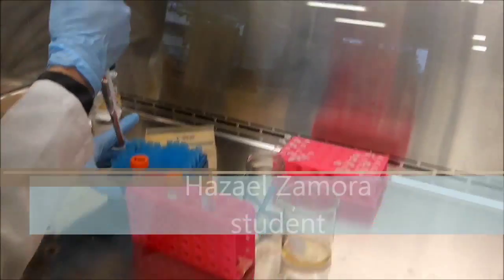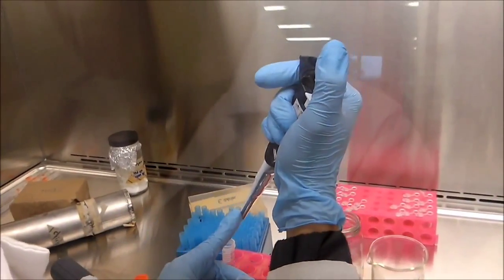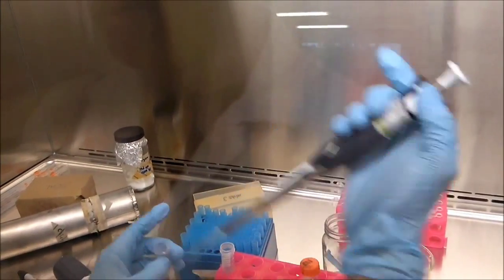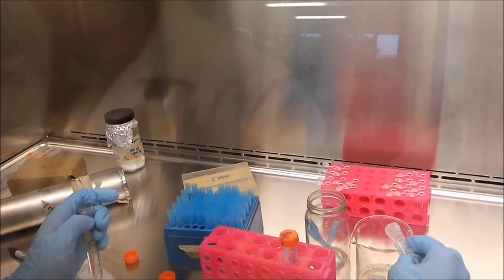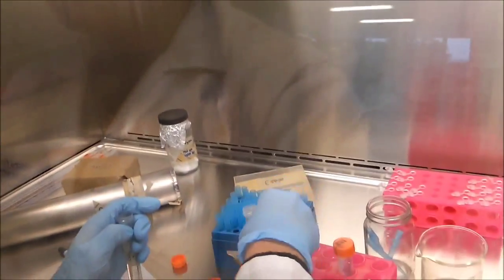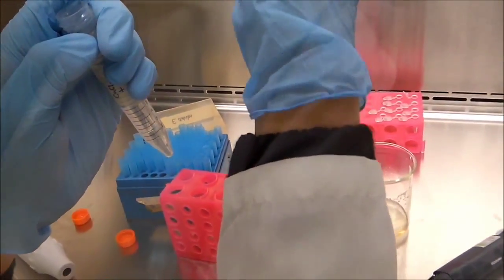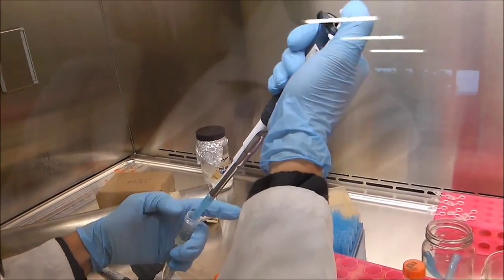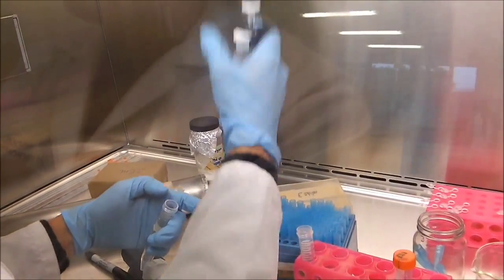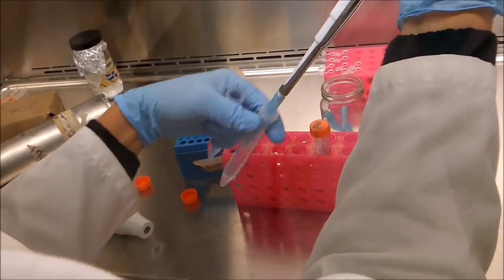For chemically competent cells, once you have obtained the pellet, you get rid of the supernatant and then you resuspend it in 10 milliliters of CaCl2 0.1 molar cold, and then you keep it incubating in ice for 10 minutes. Then you centrifuge, get rid of the supernatant and again resuspend the pellet in 2 milliliters of a solution of CaCl2 0.1 molar and 15% glycerol. Then you incubate it for 10 minutes in ice. After that, you make 200 microliter aliquots and you store them at minus 70 degrees.